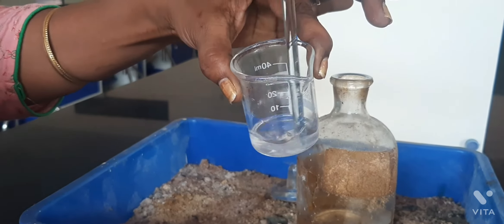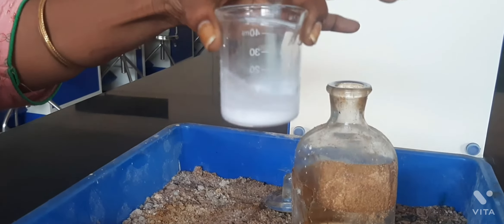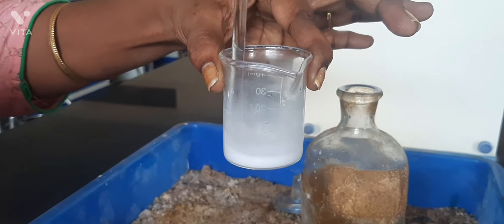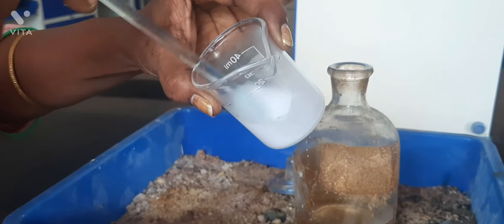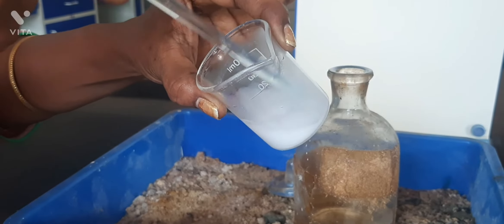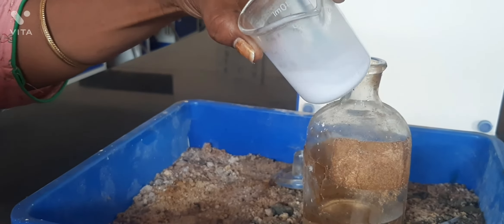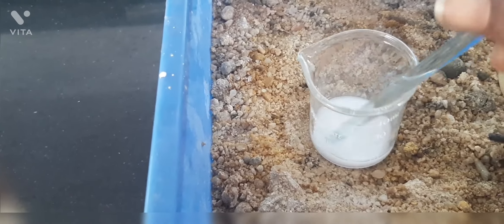This should be again stirred constantly until you get a solid mass. At this stage, if you touch the bottom of the beaker, you can feel the hotness. That means it is an exothermic reaction that is evolving heat.